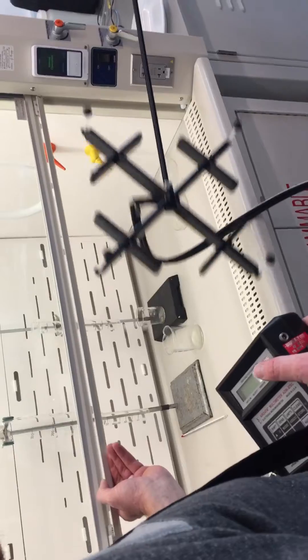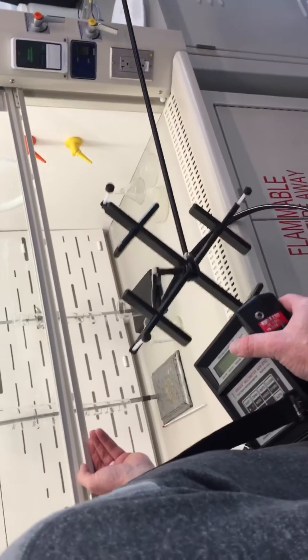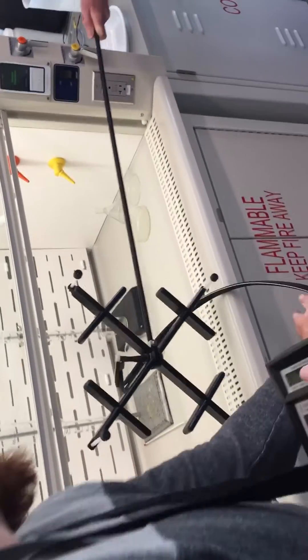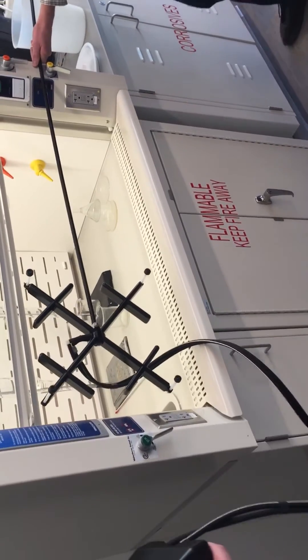Approach the fume hood, being sure to keep your body out of the way so as to not impede the air flow.